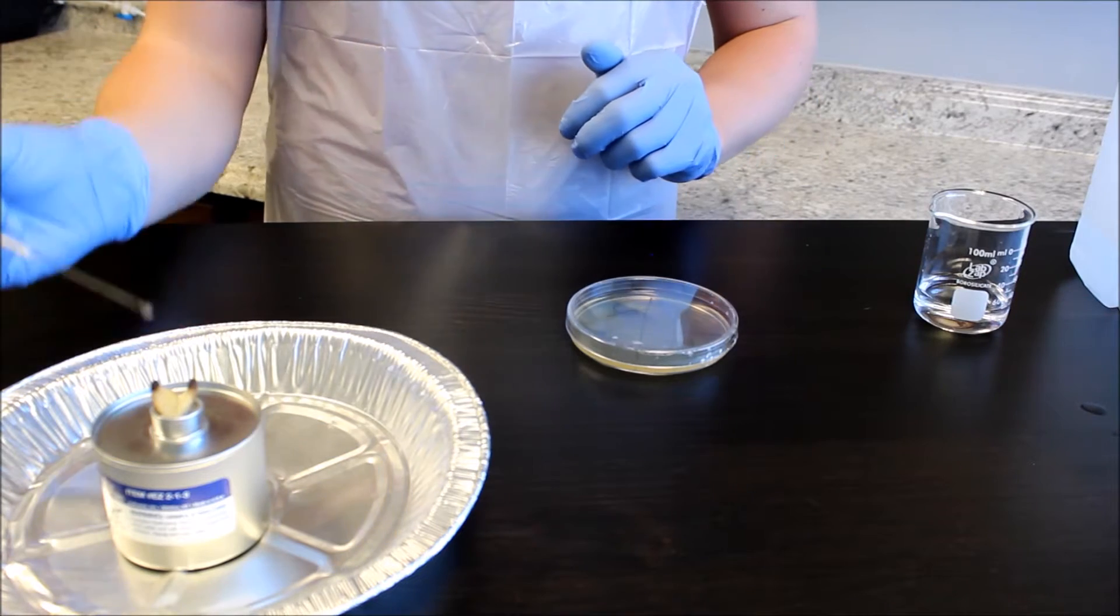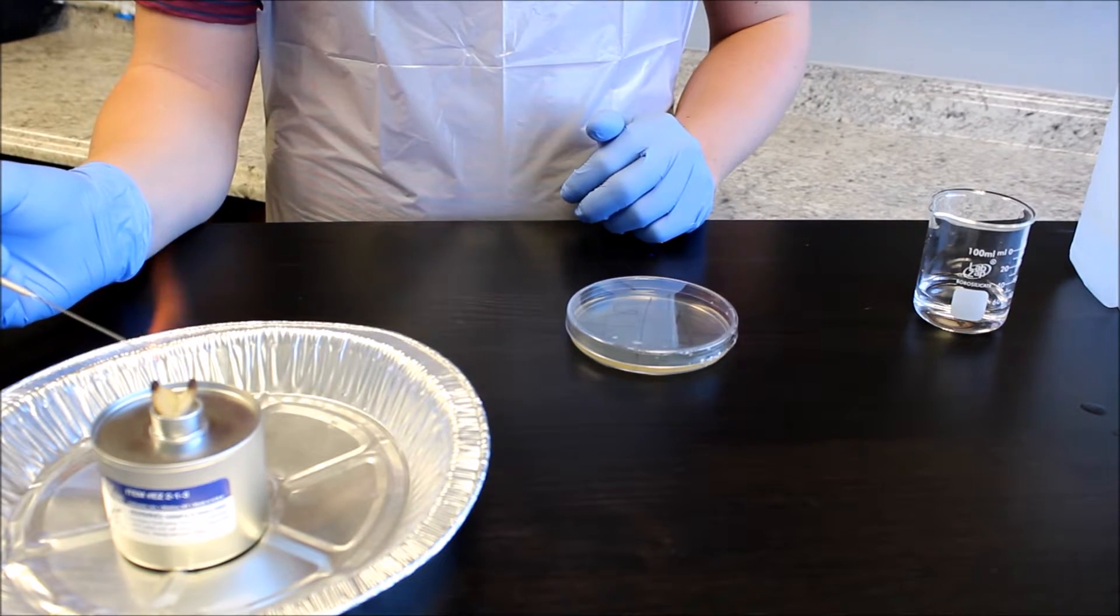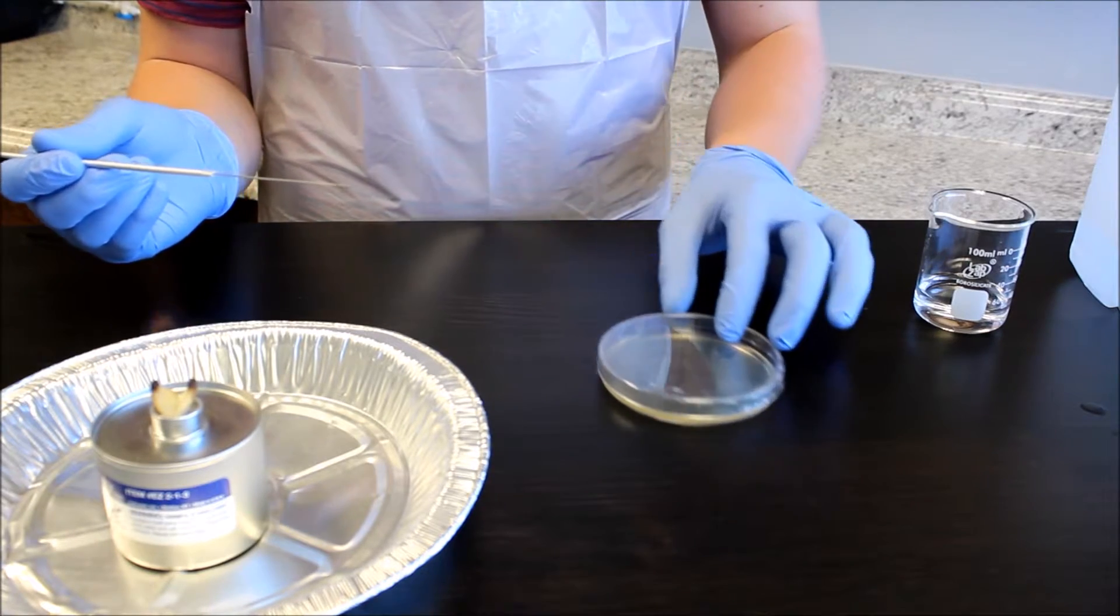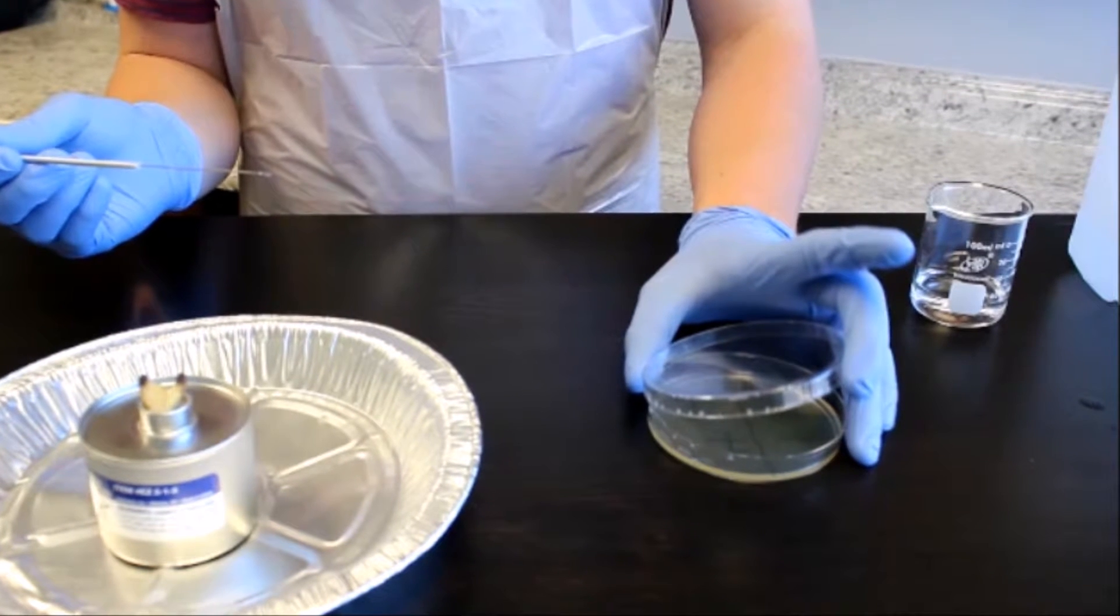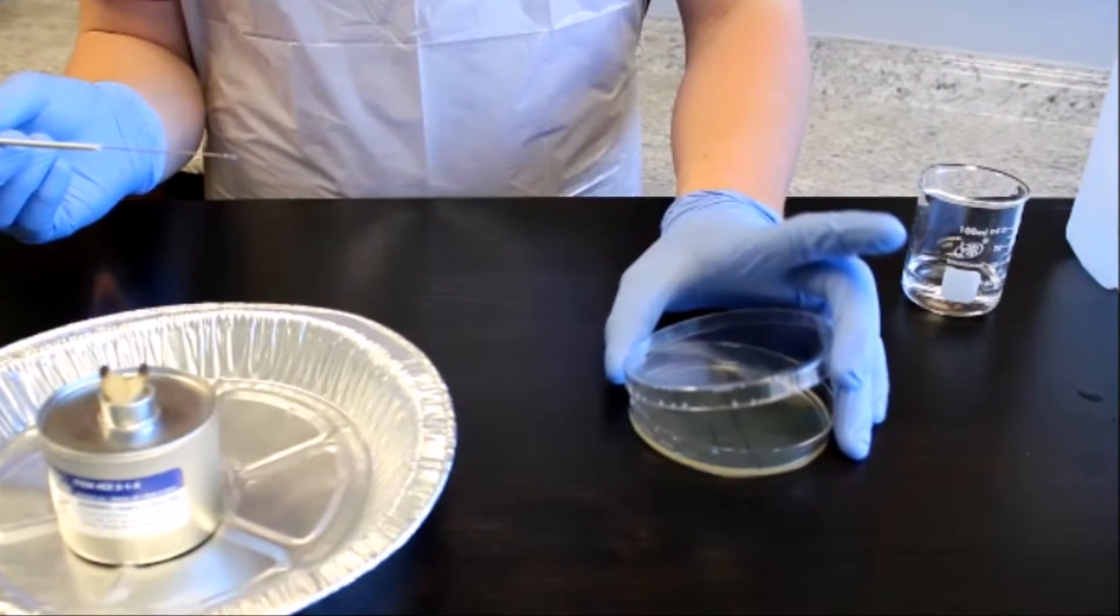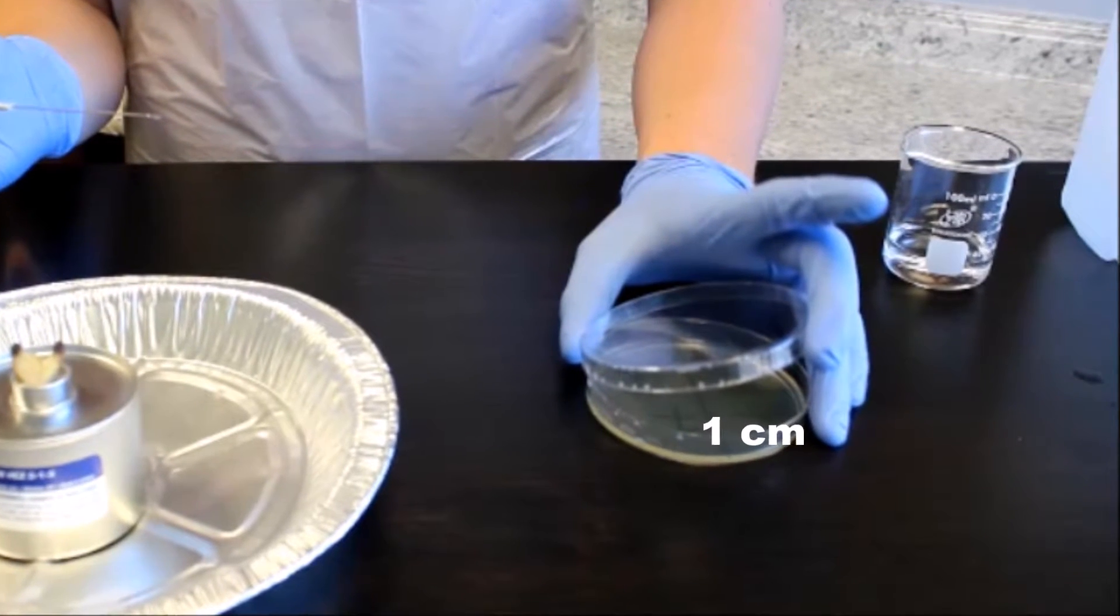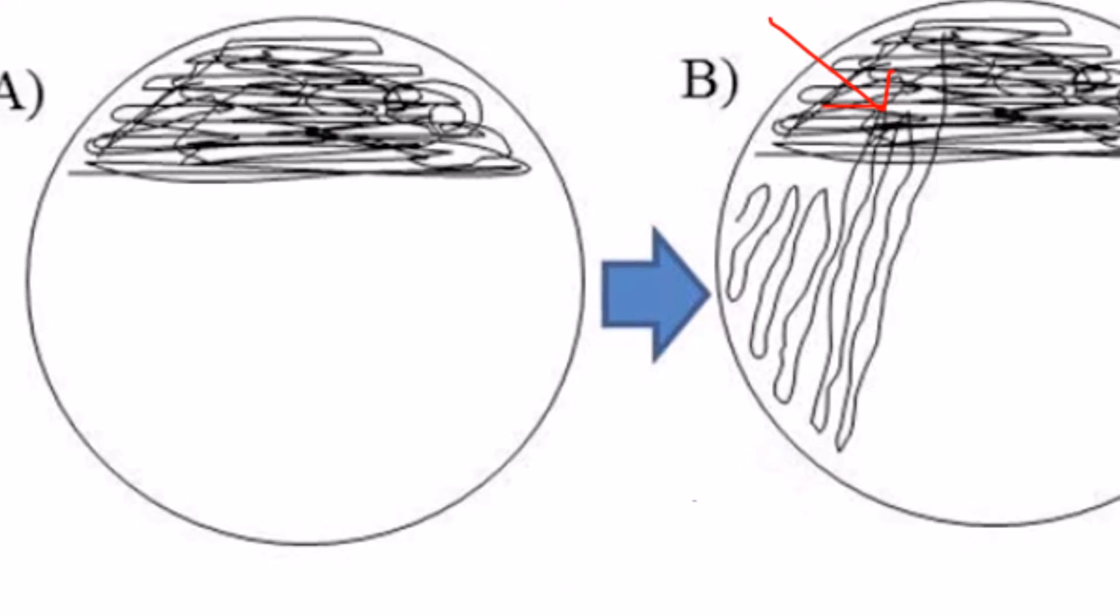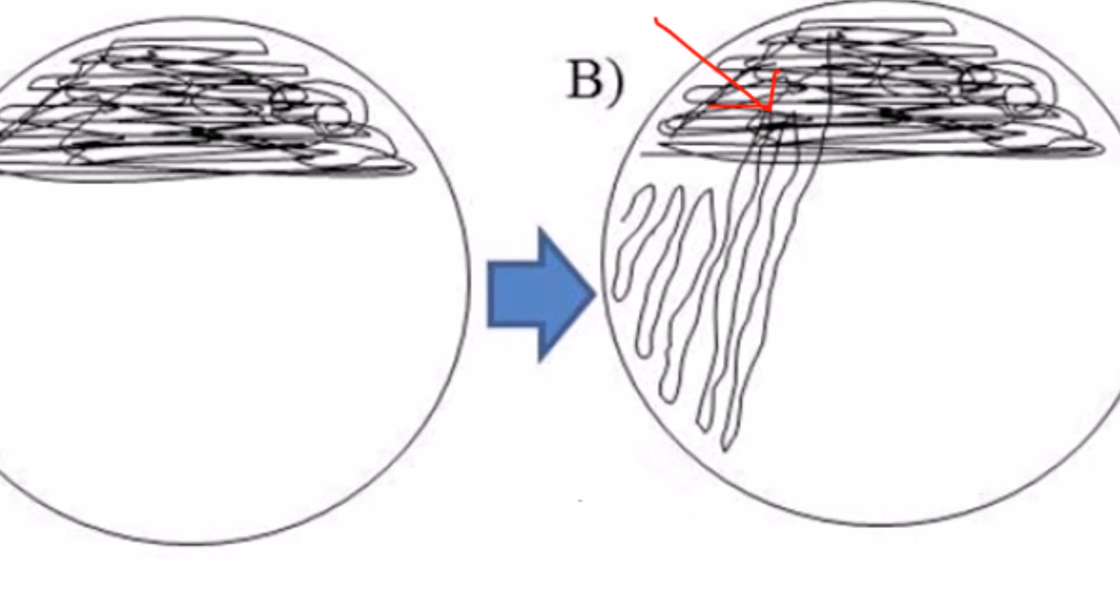Remove the loop from the alcohol and position in the flame until it glows red. Remove from flame and allow loop to cool for 30 seconds. While holding the cooling loop in the dominant hand, grasp the agar plate with the other hand, tilting the lid such that a 1 cm space is opened above the second quadrant. Pass the loop over the bottom corner of the first quadrant before streaking the second quadrant.